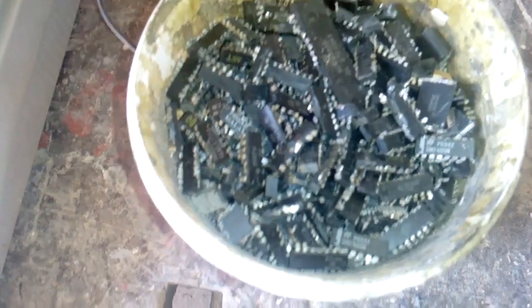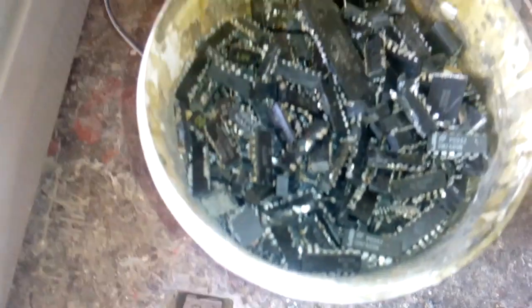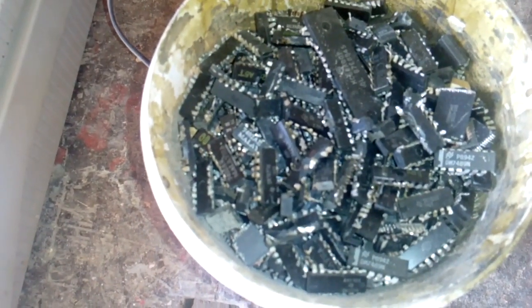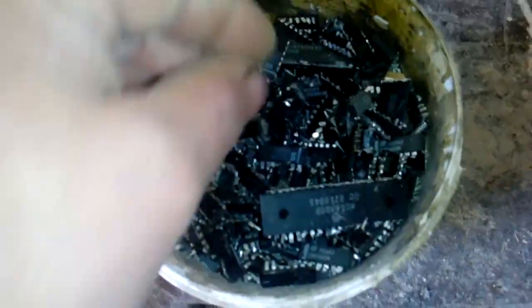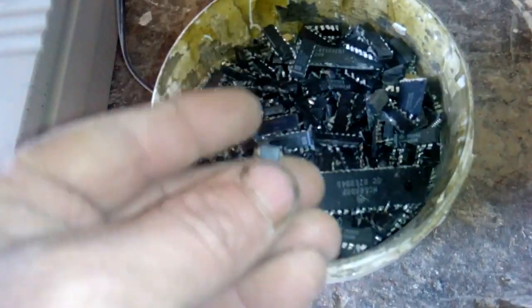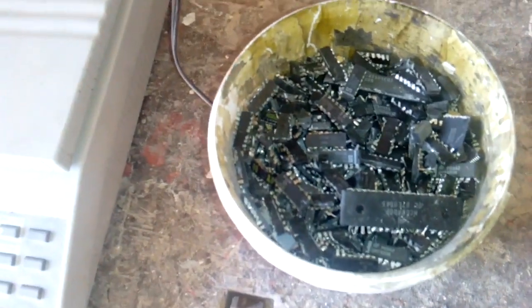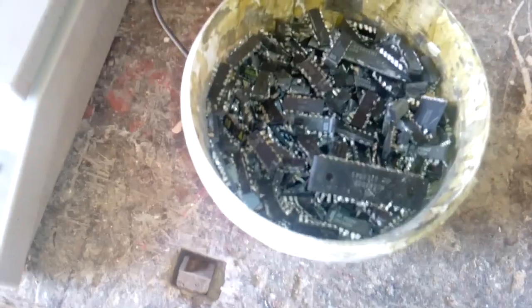Now I'm gonna process that with sulfuric acid to remove all the plastic. And the metal part we will process with the poor man's aqua regia, because a lot of these little chips contain some gold inside — gold plated legs. So I don't wanna lose that. I will process everything, every last metal part with the poor man's aqua regia.